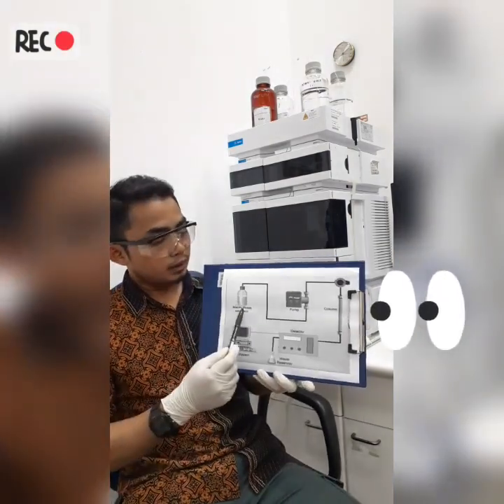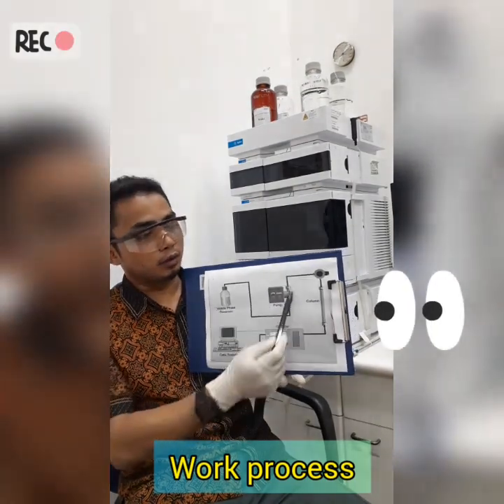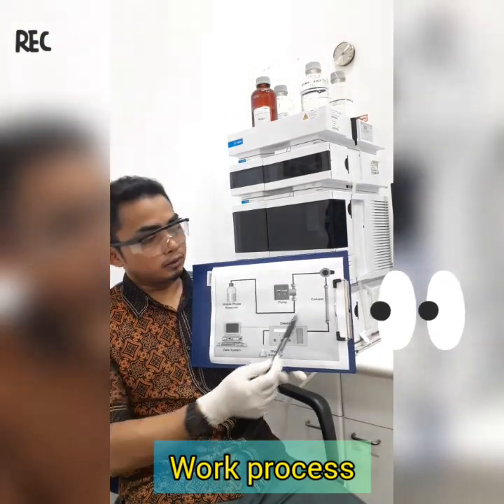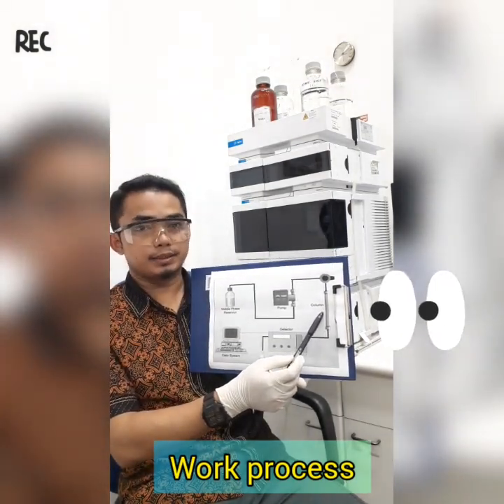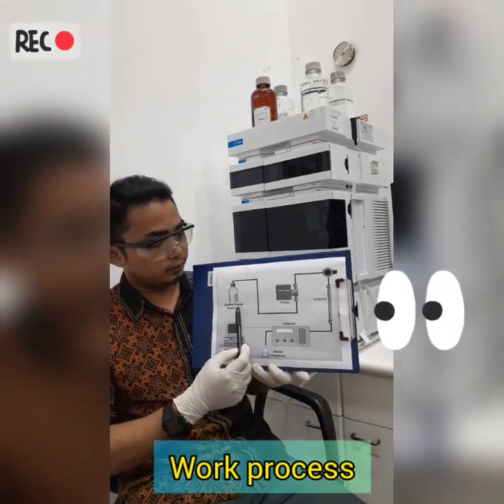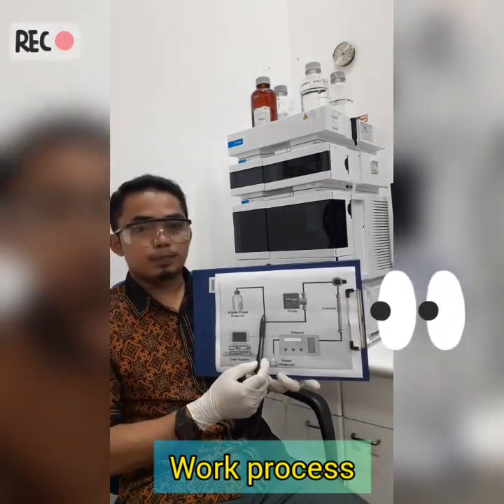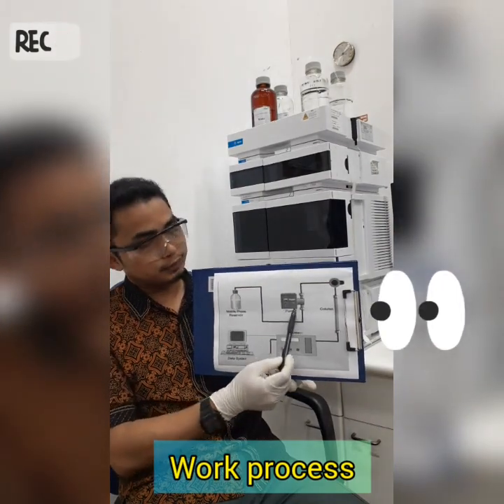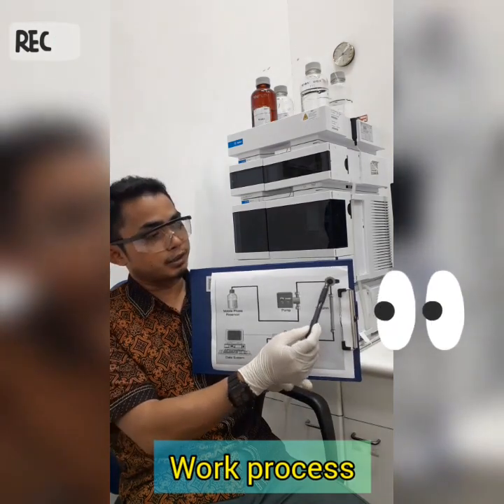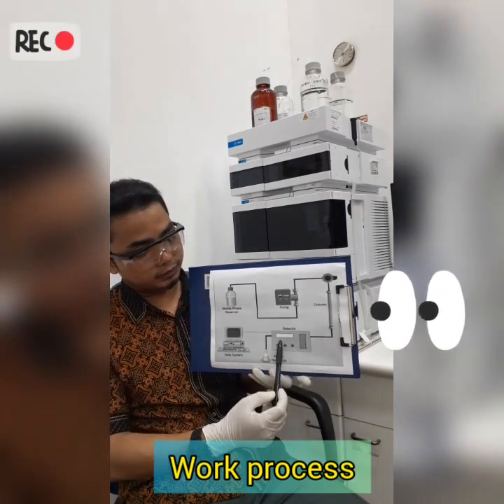The mobile phase will flow towards the column and detector. The column contains the stationary phase. The mobile phase, or solvent or eluent, is pumped with high pressure and then flows to the injection system, and then to the column and detector.